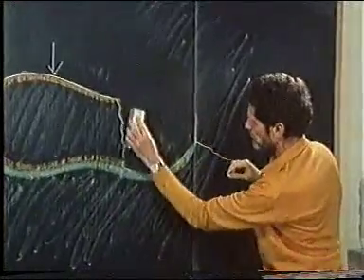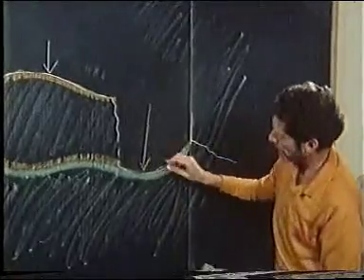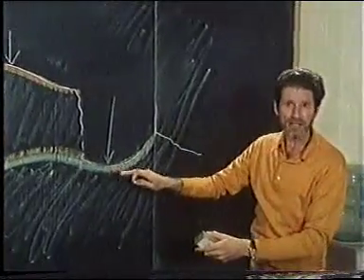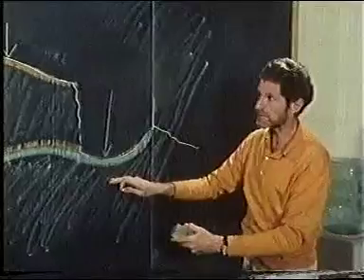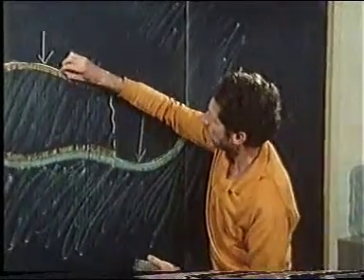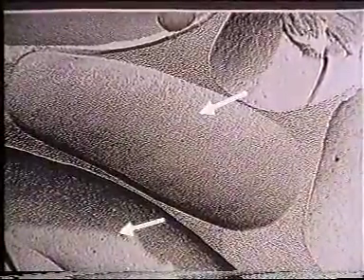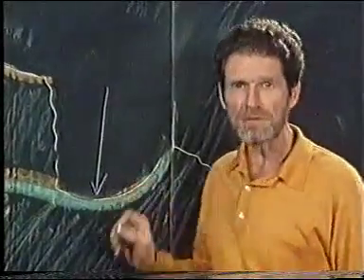Whereas here, we fracture through the cell itself, scoop it away, and what we're looking at is the half of the membrane closest to the extracellular space. If there are any transmembrane proteins in these membranes, then they show up as bumps on this fracture face or on this fracture face.